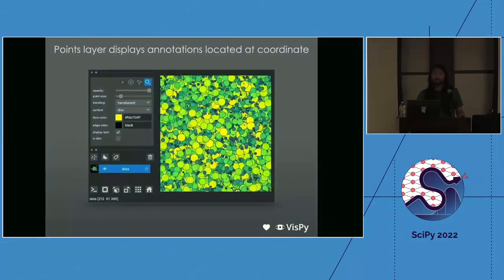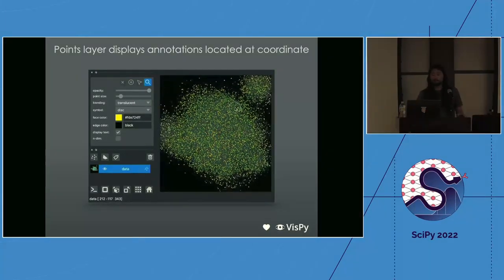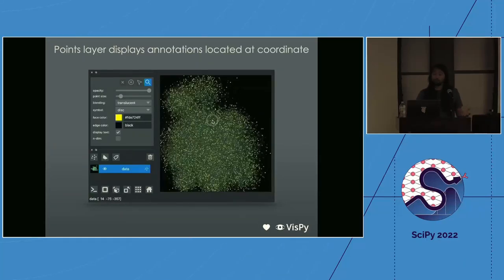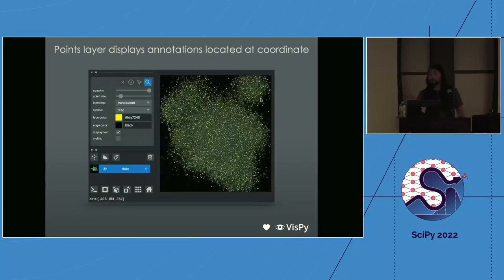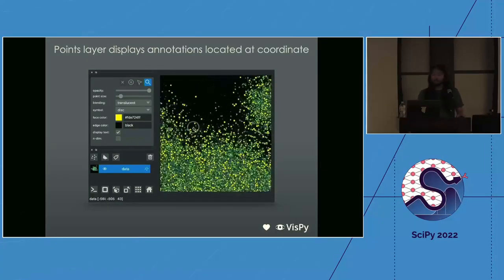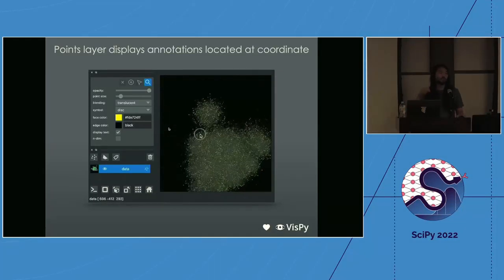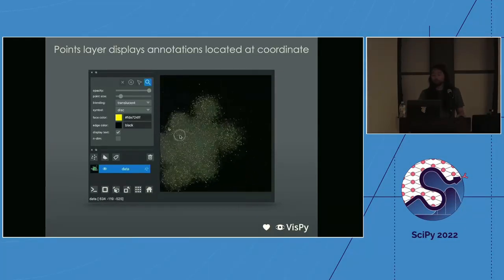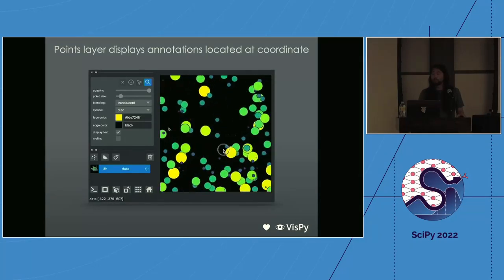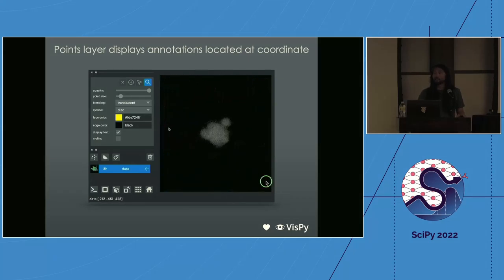Another layer type is the points layer, great for identifying objects. In biology, this is commonly used for single molecule localization or single molecule FISH, to identify where individual molecules are in your image. In astronomy, it's used to show the positions of different stars, and we allow rich coloring based on properties like type or size.